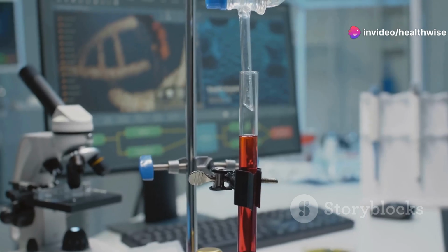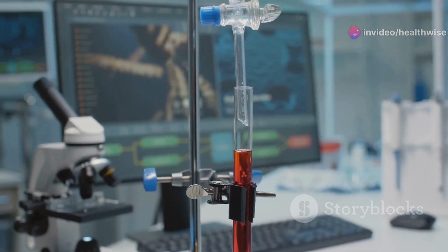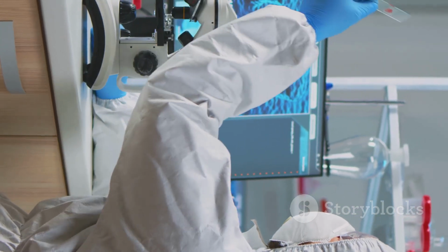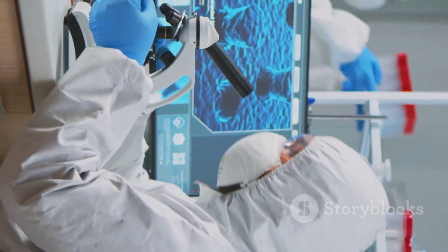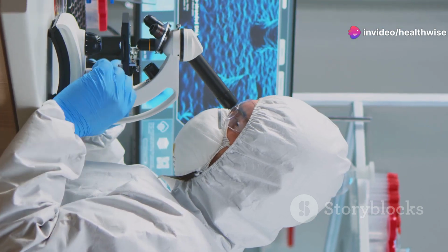Today, I'm diving into the essentials of specimen collection, documentation, and registration for laboratory tests. These steps are vital in ensuring accurate diagnoses and treatments. So let's get started. First things first, documentation and registration.